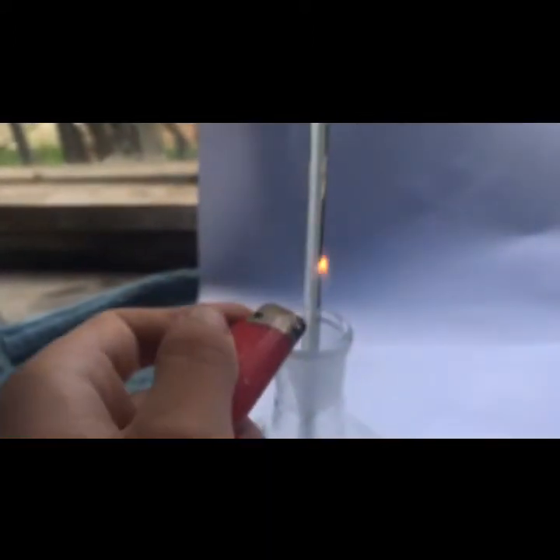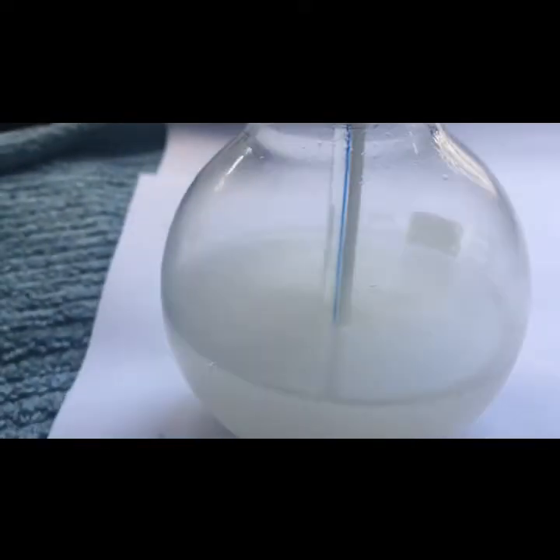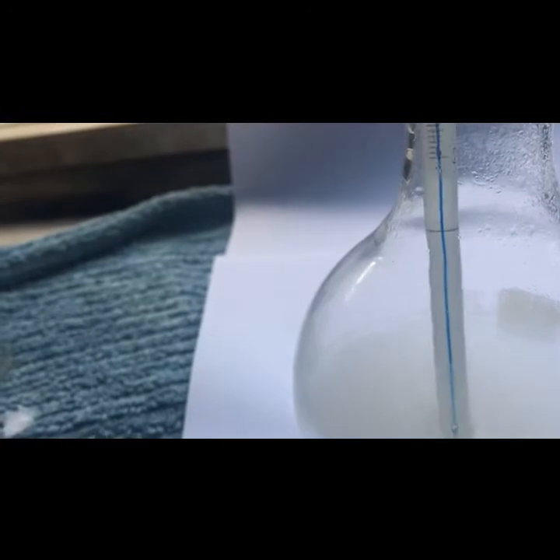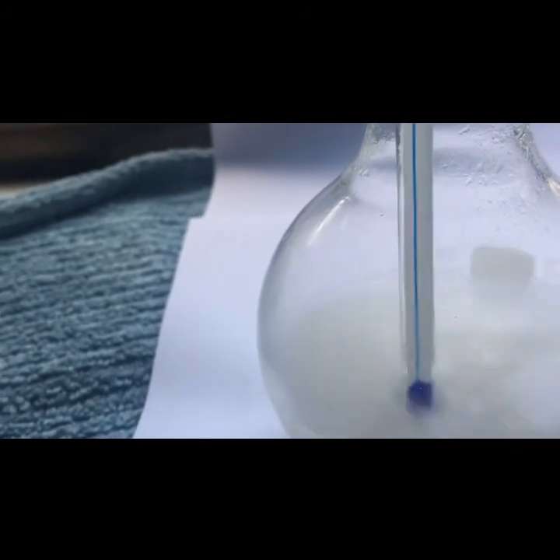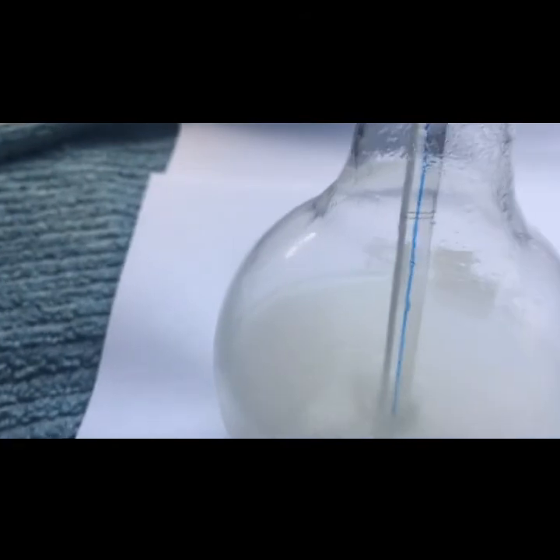Another way you can test it is take this lighter, and bring the flame to the top, and you see it goes out. CO2 gas. And that's the reaction. Swirl it a bit, and the temperature is really cold. It's actually quite cold if you touch it. It is now at around 5 degrees, and it should go to around 4 degrees Celsius the longer you leave it. So it's around 5 degrees Celsius, and then it should get a little bit colder than that, but not much.